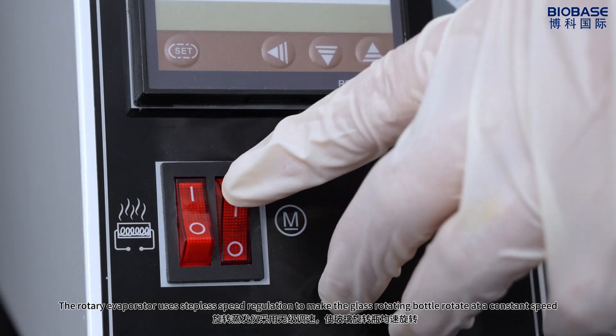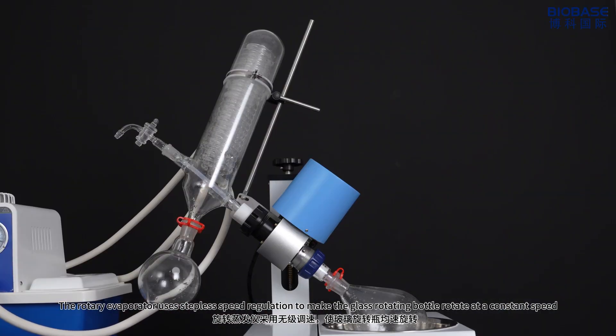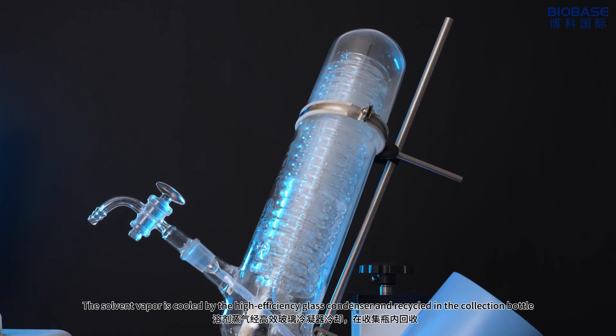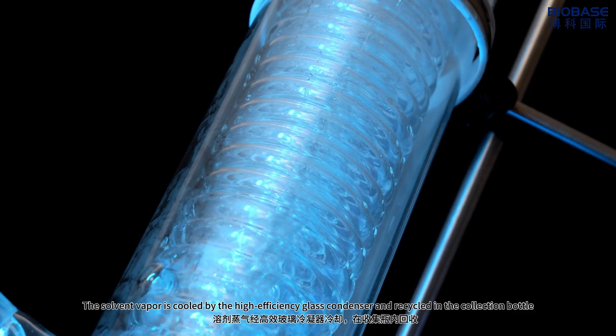The rotary evaporator uses stepless speed regulation to make the glass rotating bottle rotate at a constant speed. The solvent vapor is cooled by the high-efficiency glass condenser and recycled in the collection bottle.